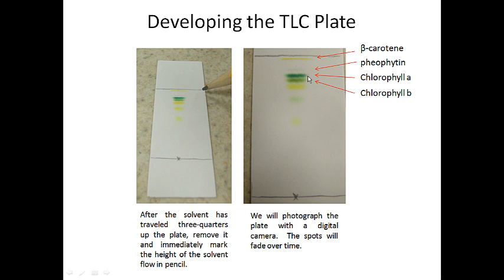I've done a little water chemistry, still do a little water chemistry, and that's typically how we've measured how much algae is in a lake. It's by measuring how much chlorophyll A we have. And in order to calibrate the instrument I use, I needed to order pure chlorophyll A, and so I know what its distinctive color is.